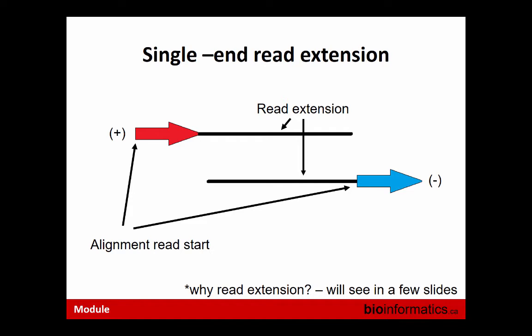But when you have single-end reads, and there is lots of publicly available data that is single-end, so we already know what the advantage of paired-end is. Maybe let me take a moment here. There are two obvious advantages. One of them is that we know precisely where the interaction between DNA and the modification happens, so what fragment we pulled out. When we know both reads, we know that the antibody was interacting somewhere between the two reads. When we have single-end, we have to infer it. We take an average fragment length, extend it, and somewhere between the read start and the end of this extension, the interaction happened. But it's more or less precise. And of course, the second advantage is repetitive elements. The placing is much better.